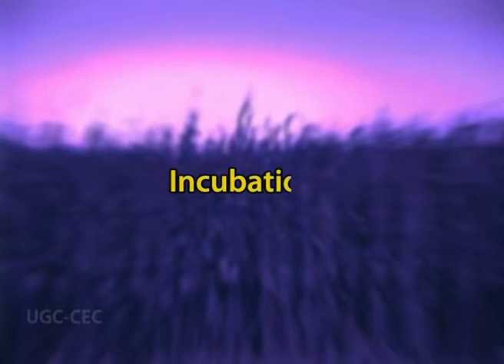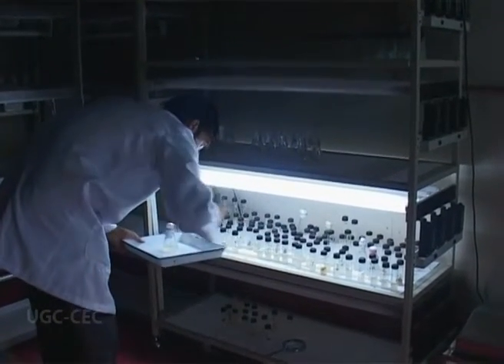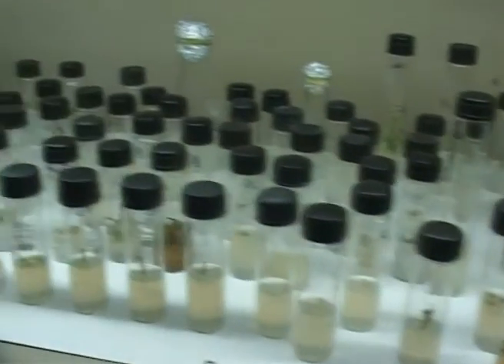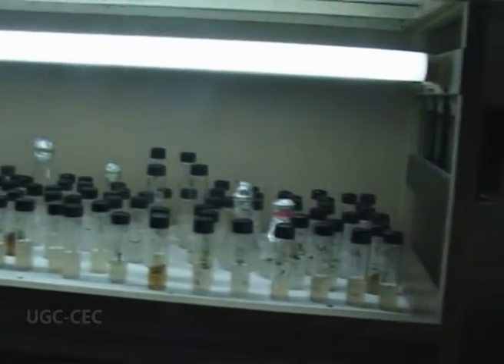The next important step in plant tissue culture technique is incubation. Cultures are incubated in culture rooms where physical conditions of light, temperature and humidity are controlled. Illumination is provided by white fluorescent lamps.